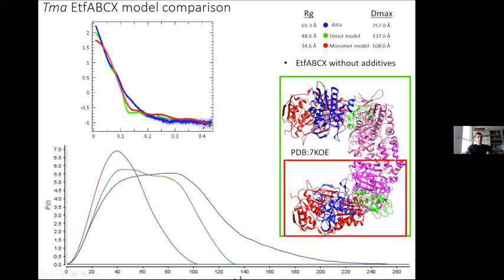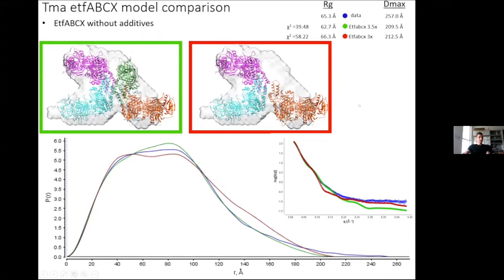If you look at the full super dimer, it's also not a great fit. And you look at the PDDF, it doesn't fit well. So that means something else is going on with this protein in regards to the solution state SAXS data. So I have tried doing some more modeling with this. I tried computing a shape, and this is one of the better shapes that looks representative of what it is.